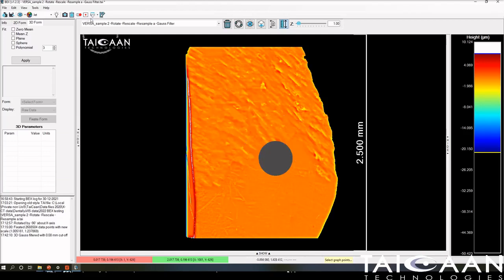So let's remove the brush. So that feature is there. The data's been temporarily removed from the surface. It's not been saved, so we can just put it back in if we want to. But actually what we want to do is just click here, and we've done this in our previous presentations, and simply go to invert the selection. If we were to make the section bad, the section would be removed permanently. But all we need to do is invert the selection. So in other words, click that and you'll see what happens straight away.